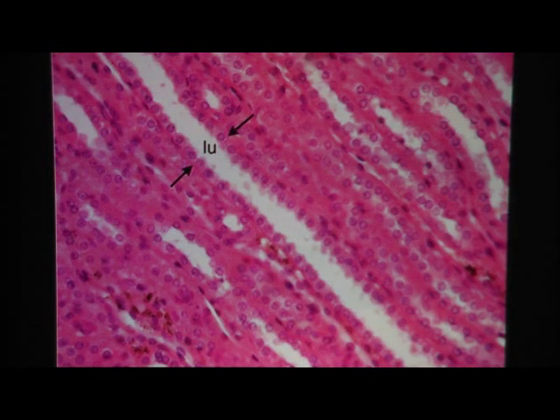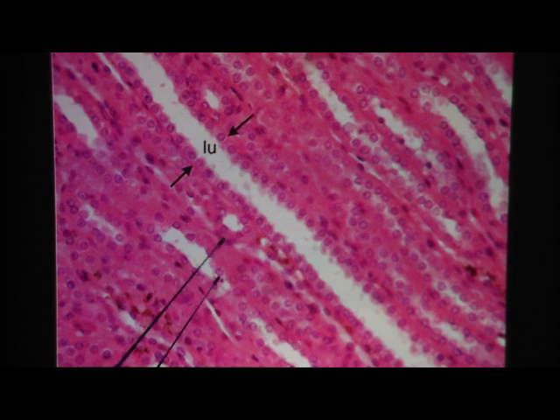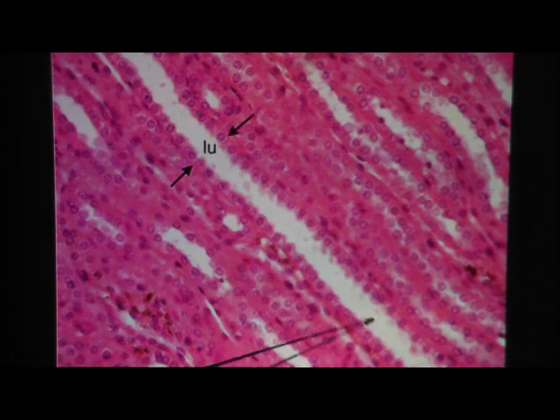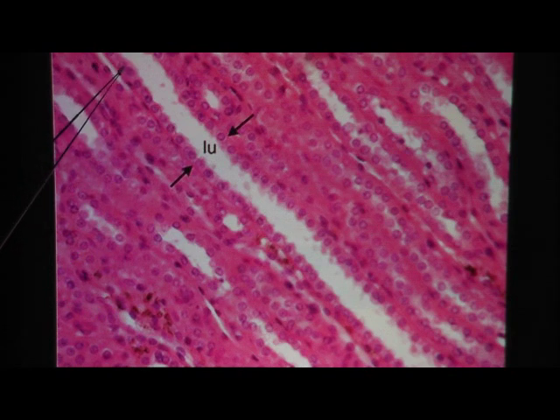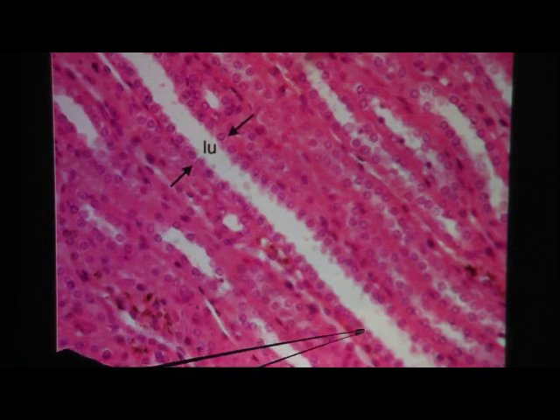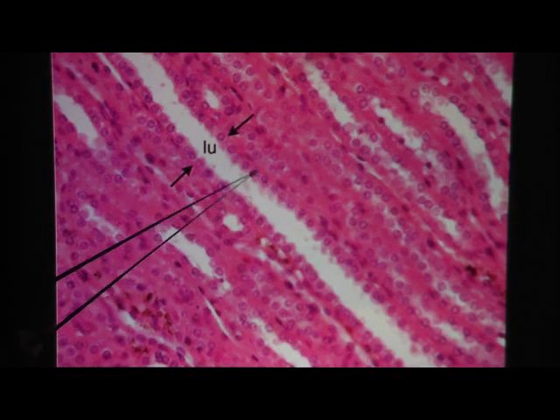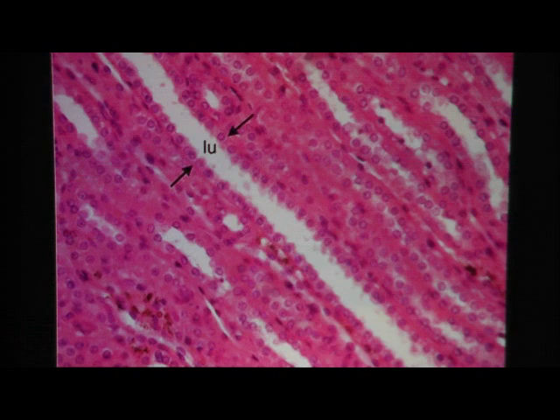Here's a low-power view, meaning it's not magnified very much. But even at this magnification you should recognize this as epithelium — the walls lining this structure are one cell layer thick with nice round nuclei. So it's fair to say it's simple cuboidal epithelium.